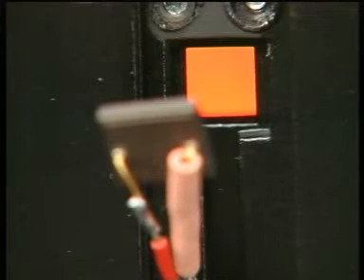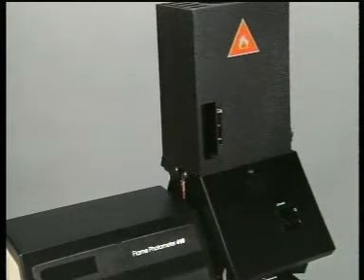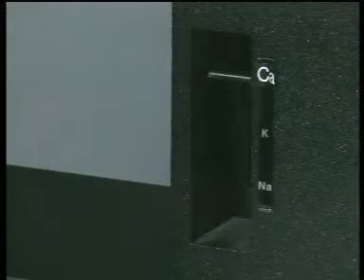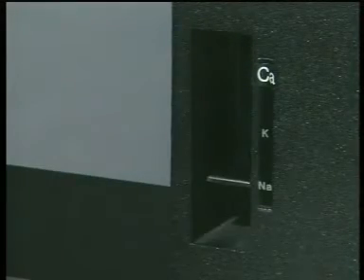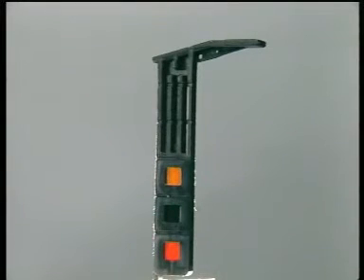The light from the flame passes through a window to a photodetector which covers the opening and is normally hidden inside the hood. This instrument is set up to measure calcium, potassium, or sodium. Movement of the bar moves different filters in front of the detector. Each of these only lets light of a wavelength specific to the element in question reach the detector.